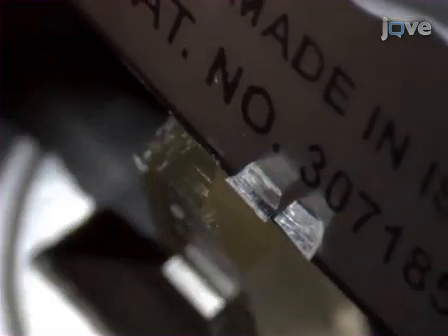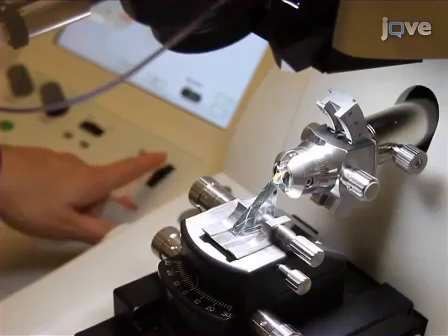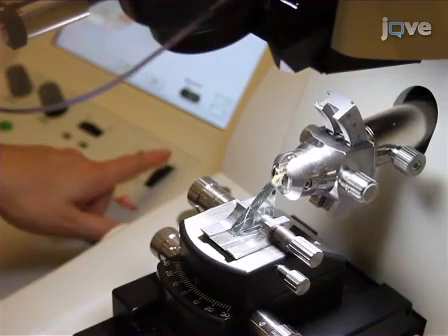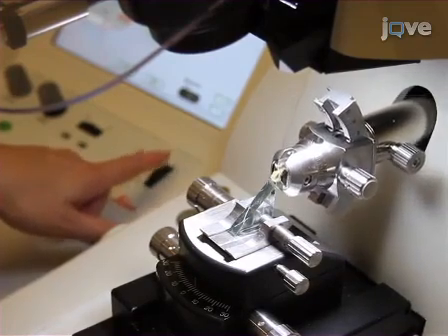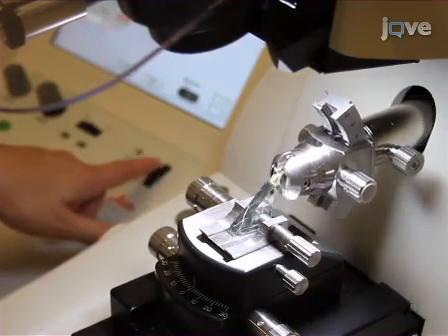Cut the edge of the block close to the region of interest at an angle to the block's top surface. Using a glass knife fixed to the ultramicrotome, further trim the block so that the region of interest can be precisely located with respect to the dimensions of the block's surface.